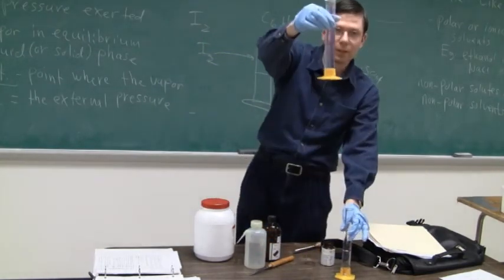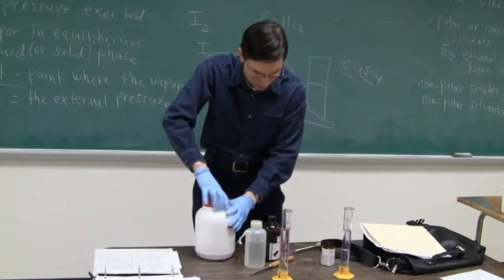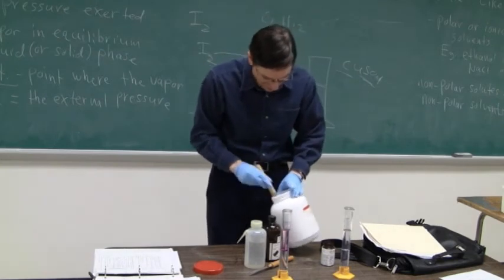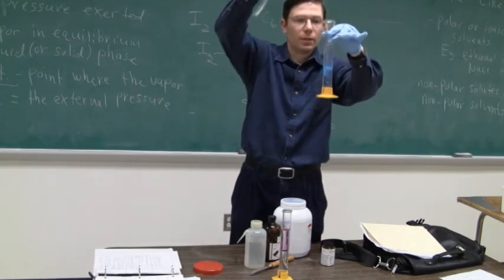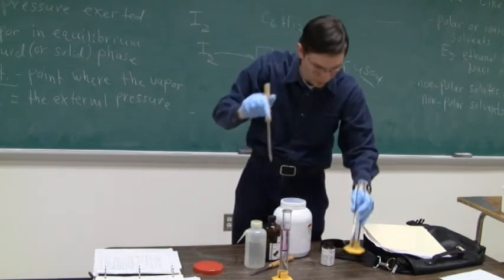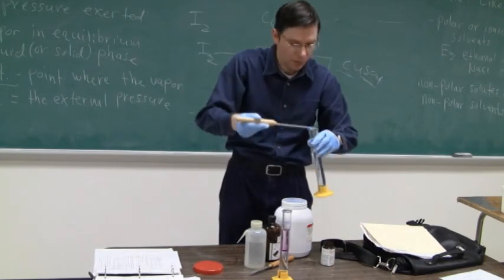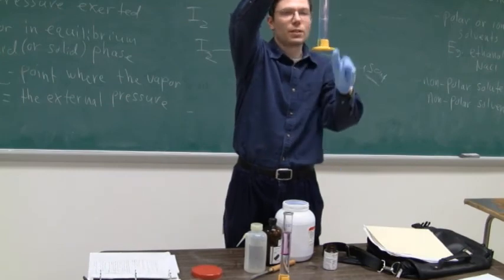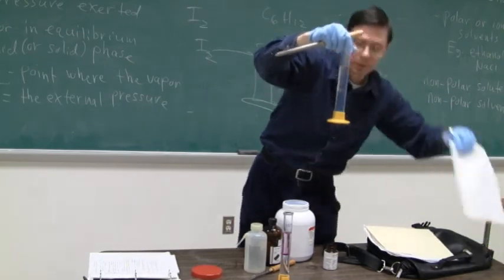So, again, we have our nonpolar species here. And, let's see what happens with the copper sulfate. We know copper sulfate is a nice, pretty blue compound. It's often used to make crystals. So, now, again, a little bit of floating here. Let me put a little bit more in, so we can see it. Again, some may stick to the side just due to adhesive forces, but you notice that you have the blue layer back here. And, this gives you the white background a little easier to see it.